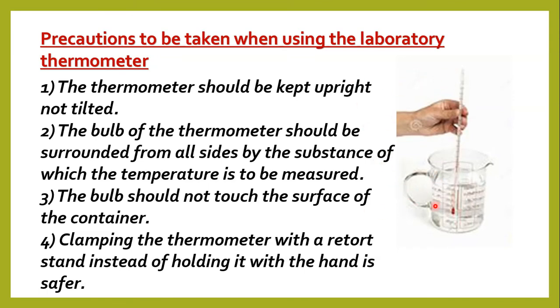Good. So today we touched on how to measure temperature of warm water using the laboratory thermometer, and then we noted some precautions that must be taken in order to ensure proper measurements.